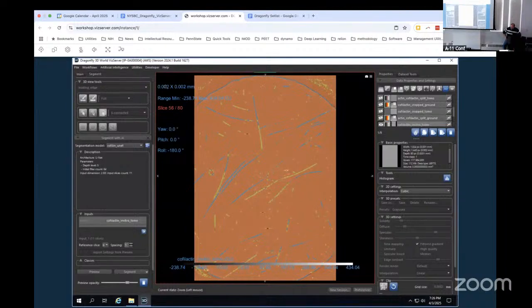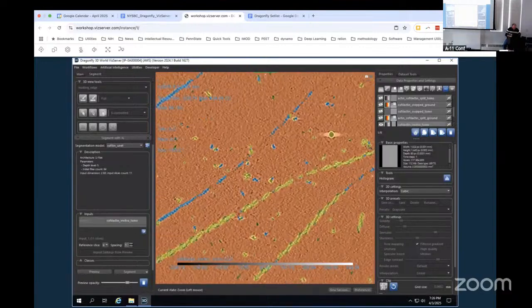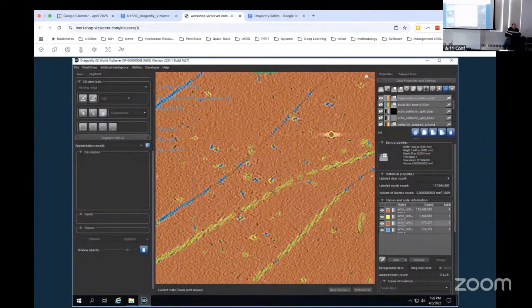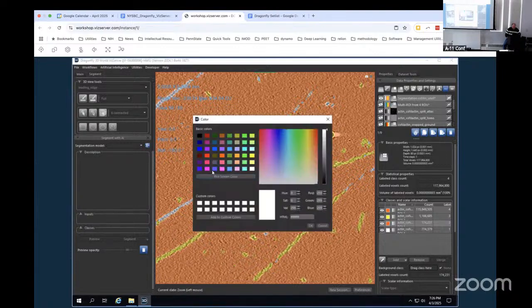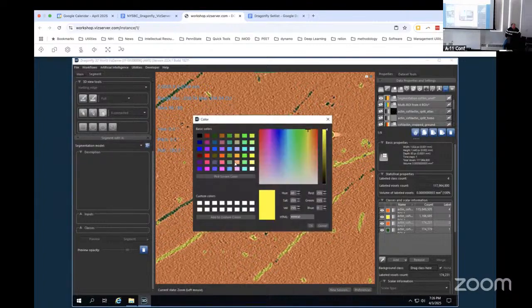So it did a pretty spectacular job. Let me see. Maybe the colors are kind of crazy. Let me see if we change the green to, let's go red, and then let's take the background and make it white so that it's higher contrast. That's not the background. I forgot to label these things apparently. So let's go green. Let's make this one white. Okay.